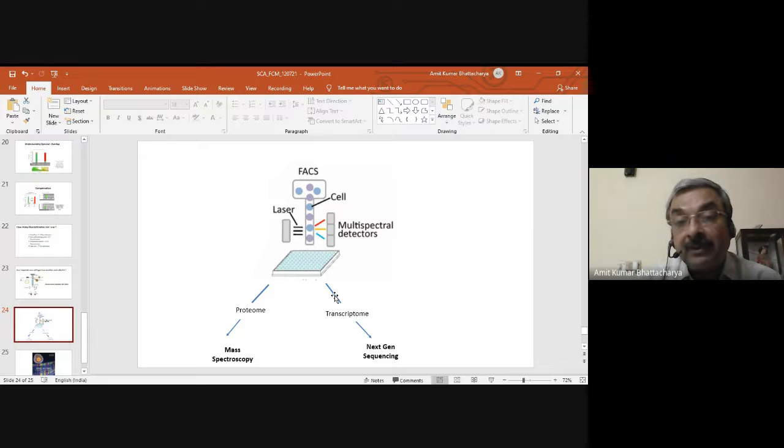That is therefore possible, because now in this well plate, in each well you have one cell. You can now do a total protein analysis by mass spectroscopy, and look at the total proteome of each cell on a per cell basis.